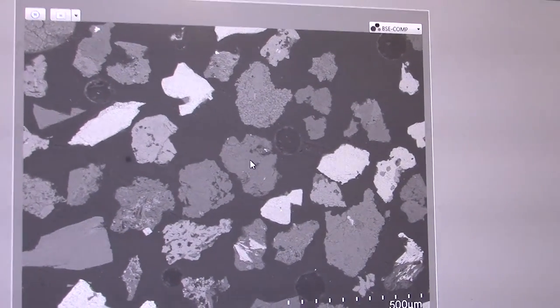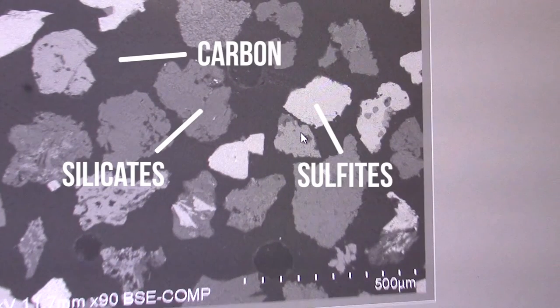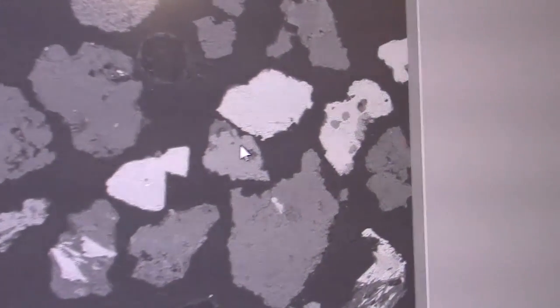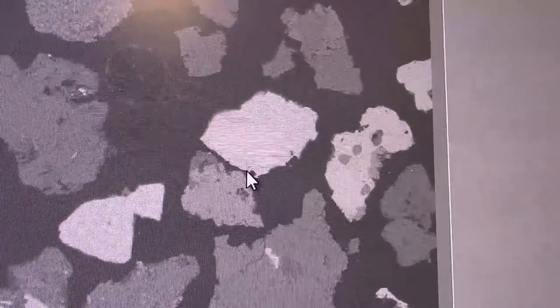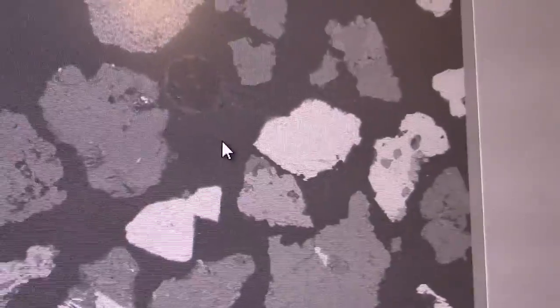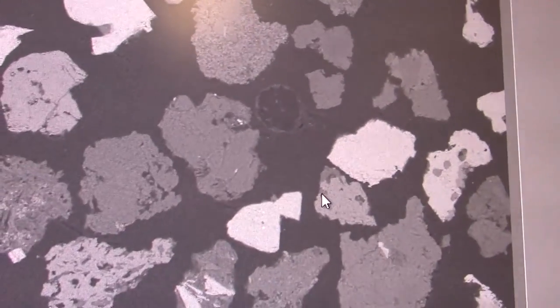The gray ones tend to be silicates and these bright ones tend to be sulfides. The way it's set up is you get farther down the periodic table, you get brighter and brighter. Backscatter is based on gray scale, so black is zero and white is 255. There are all these different layers in between with numbers. The brighter you get, the farther you go down the periodic table.